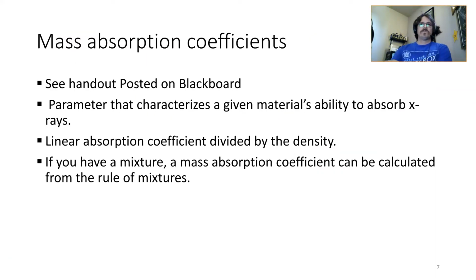All right, mass absorption coefficients. I've posted a handout on Blackboard giving some tabularized mass absorption coefficients. Sometimes this data is kind of hard to find, but I found another database of mass absorption coefficients that I'm happy to show you in this lecture. It's a parameter that characterizes a given material's ability to absorb X-rays. It's essentially the linear absorption coefficient divided by the density, and we talked about this already.